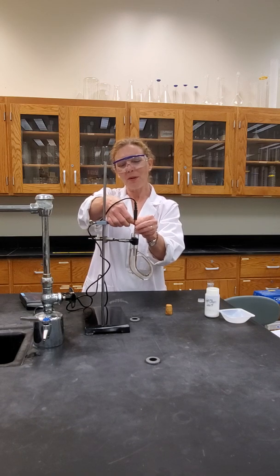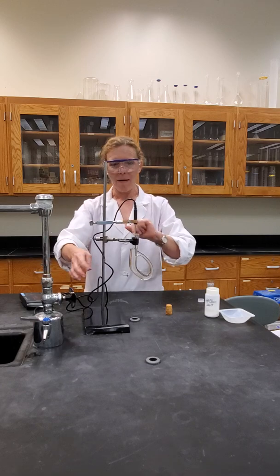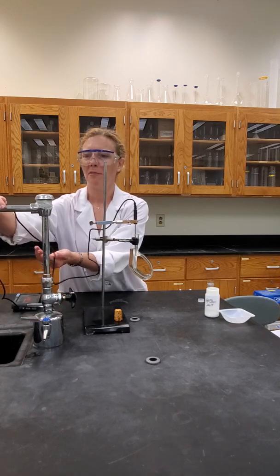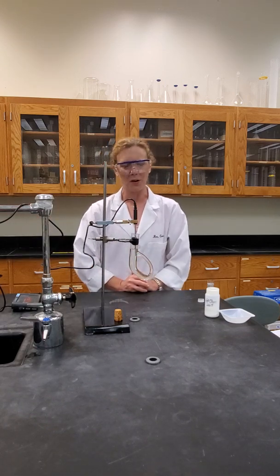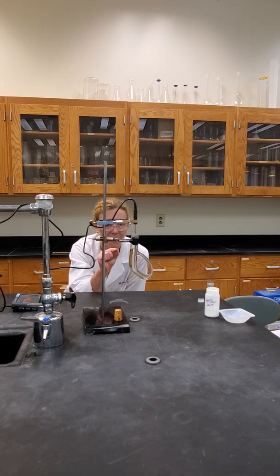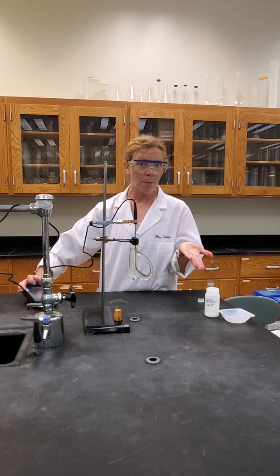We know that sometimes our lab equipment will just not cooperate as quickly as we'd like it. All right, now, I also need to make sure that my wiring won't come close to the temperature probe. You could utilize another secure object like your faucet to just keep the electrical wiring away from the Bunsen burner. Now, what I would suggest is that, you're a team, so I would have one person definitely keep their eye on the sample, and then one person more on the reading of the LabQuest or the LabPro.